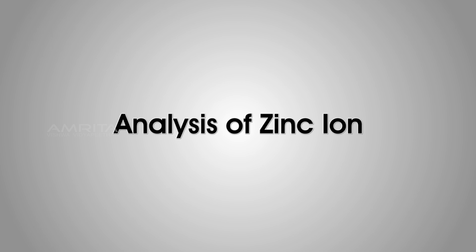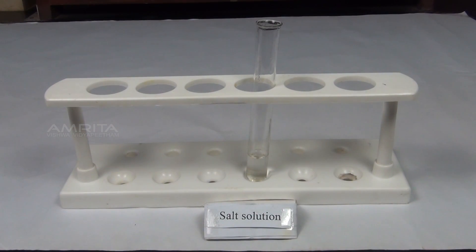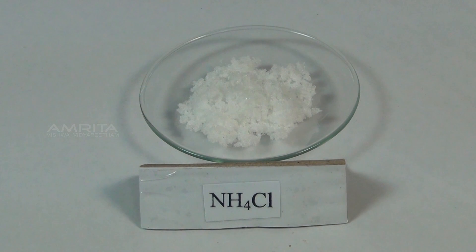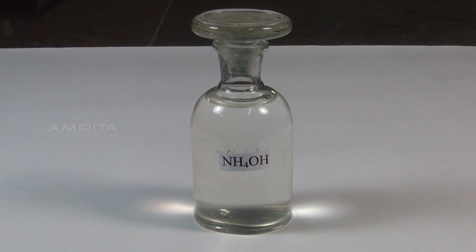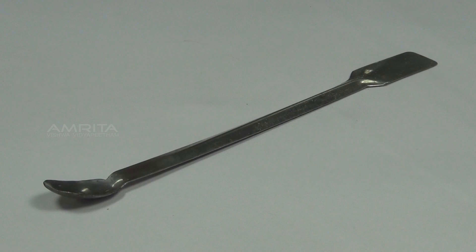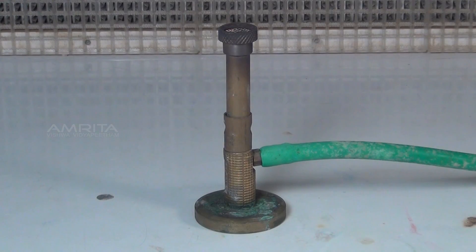Next, we look at the analysis of zinc ion. Materials required: salt solution in a test tube, concentrated nitric acid, ammonium chloride, ammonium hydroxide, hydrogen sulphide gas, spatula, droppers, test tube holder, and Bunsen burner.